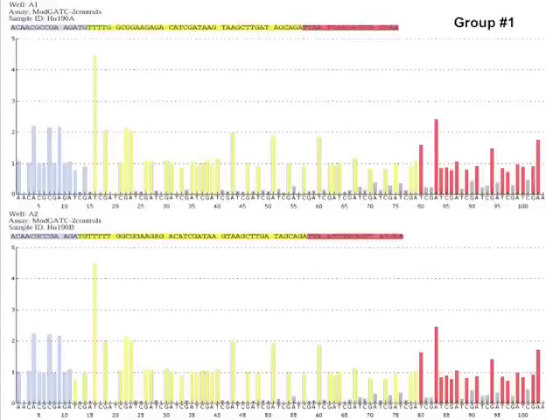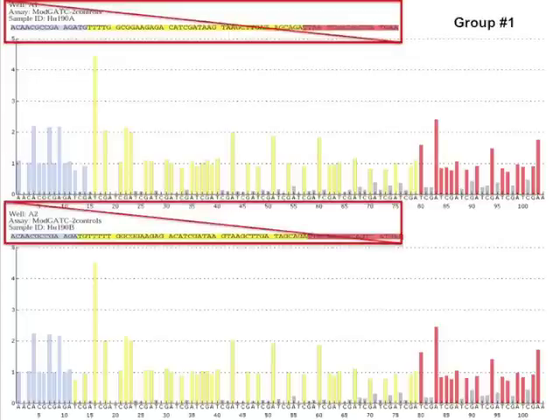So let's take our hypothetical group number 1 here. And the first thing I want you to know is to not pay attention to the sequence that's in the upper left-hand corner on each pyroprint. Just to orient you, each one of these histograms is a separate pyroprint. So the first individual in a group, human 190A, that's the pyroprint for their particular isolate that they analyzed. Okay, so we're going to compare these two different panels. Remember, within a group you have 3 people, so you're going to be comparing this across all 3 of your pyroprints. But again, I don't want you to pay attention to the nucleotides up there in that left-hand corner. Just pay attention really to the histogram itself.